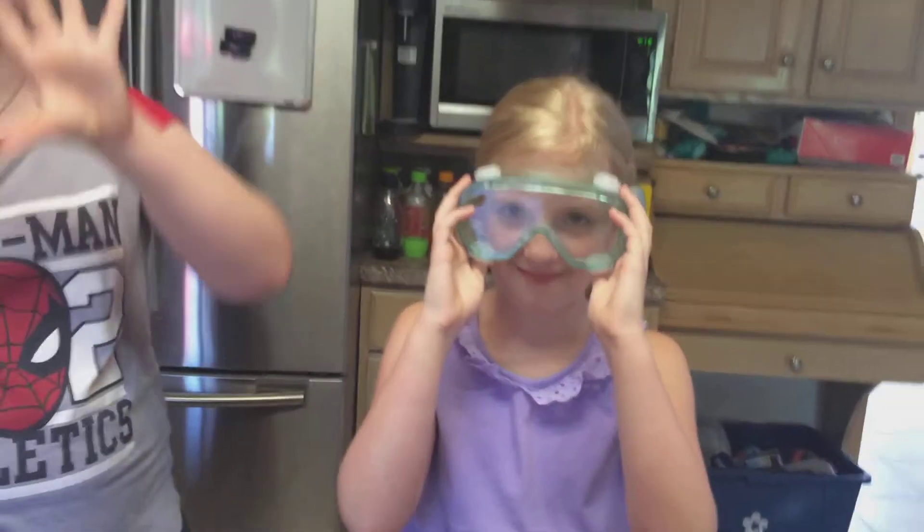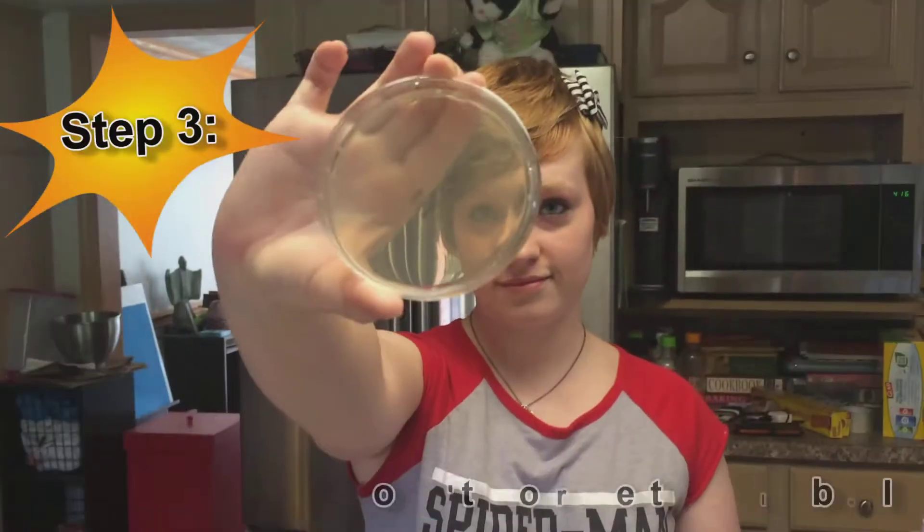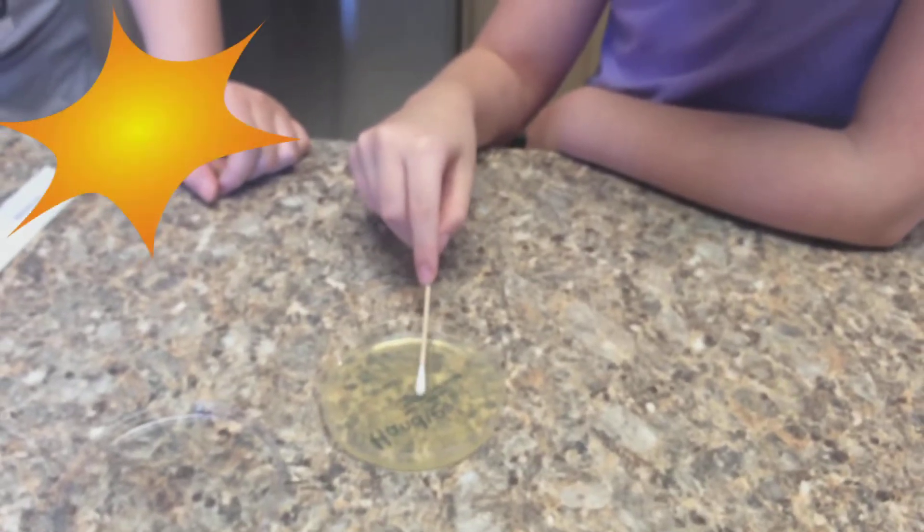KK is wearing goggles throughout this experiment, but they are not necessary — they just make her feel like a scientist. Make sure to label your plates so that you know where the bacteria came from. This is very important so you don't mix them up.